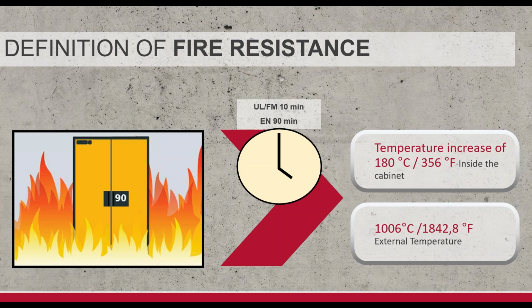So here's kind of how things test to the standards. Yeah, there's a lot of heat on the outside, and you can't reach the temperatures described right there. 356. Some standards talk about an increase of temperature. Some people talk about a max end of temperatures. It just depends. It's all chasing that same goal: don't hit the auto ignition point of paraffin oil, or that 400 degrees in general, on the inside. So that's it on kind of standard stuff and flammables.